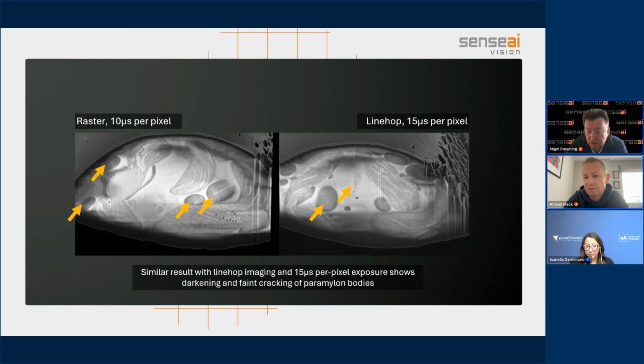Nigel? Yeah, so the actual sparse sampling system doesn't have to have exactly the same subsampling from one frame to the next. Obviously, if you're going to try and use some interleaved method where you're using multiple frames that are subsampled together, then it helps if you're balancing those out against each other and the pixels that you're going to sample.